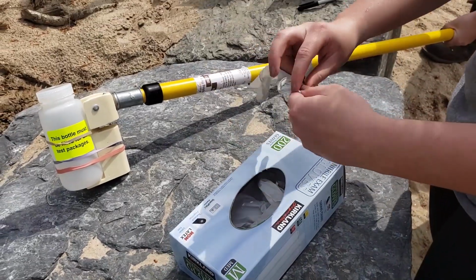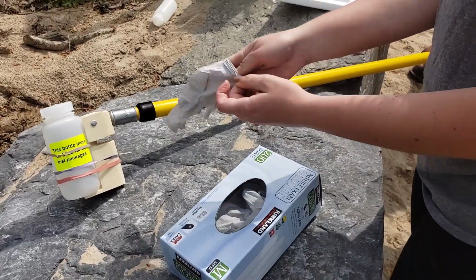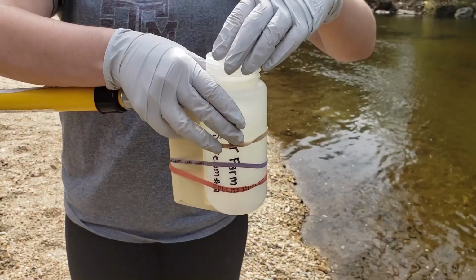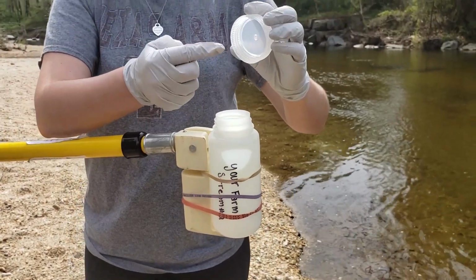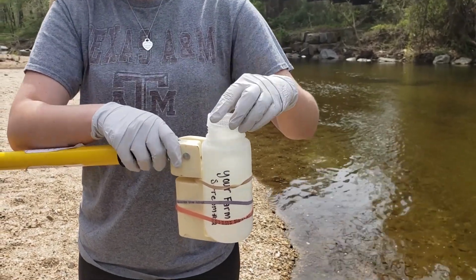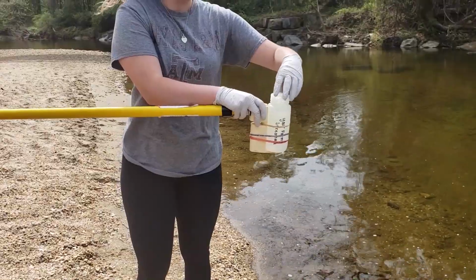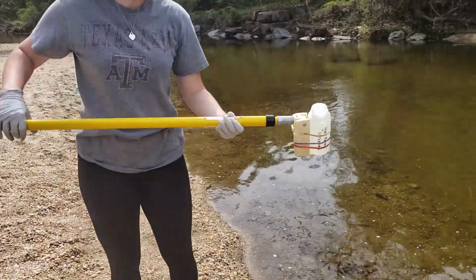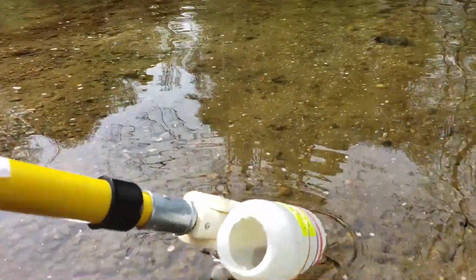At this point, we recommend putting on gloves as an extra step to avoid contamination. When taking off the lid of your bottle, take caution to not touch the inside of the lid or rim of the bottle, as this can contaminate your samples. An assistant may help to make sure the lid doesn't touch the ground or other sources of contamination.